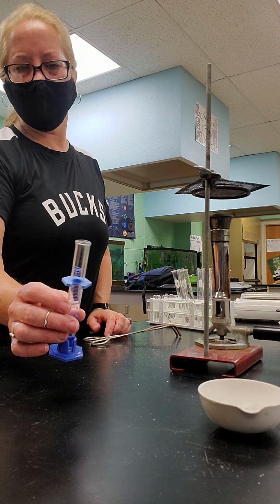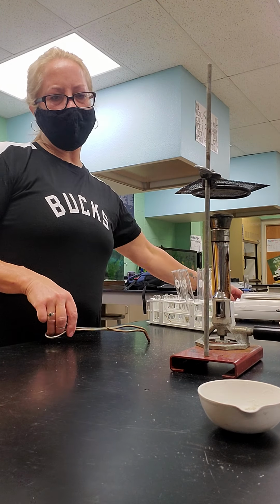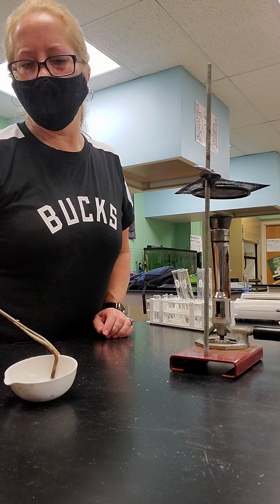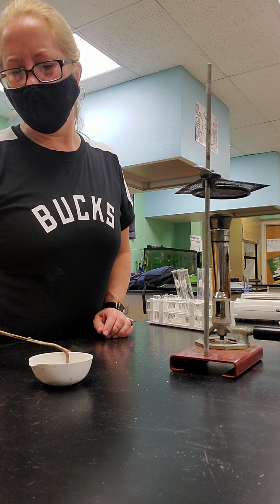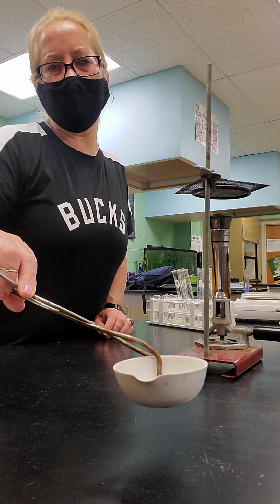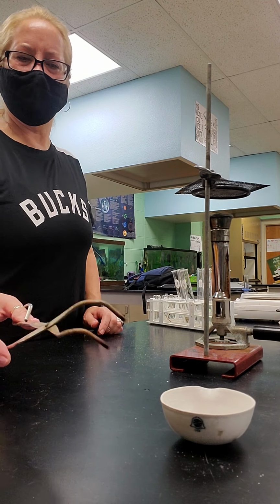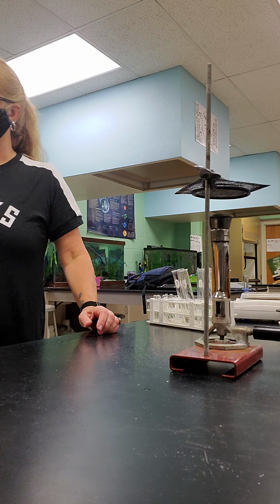So now we're going to add some ammonia, and basically just to see, does it dissolve? Did it make a precipitate or a color change or anything? Okay, so we have a white precipitate in there. So with silver nitrate plus ammonia, white precipitate, and that would be chemical. Okay, so now we're done with that part.